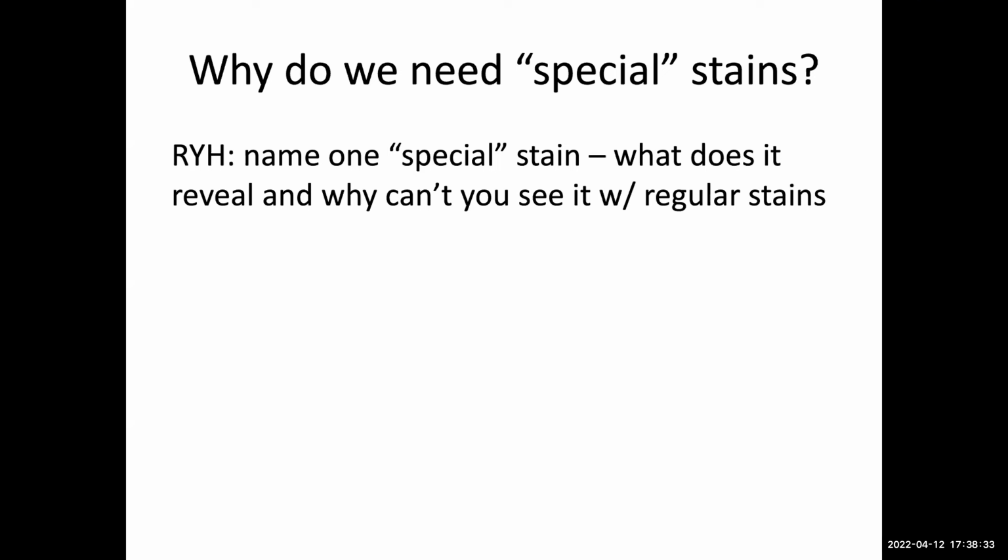But yes, you're absolutely right. It's a combination of dye and mordant alternately applied. So dye, then mordant, dye, then mordant. What mordants do is thicken stain. So it's kind of like a mascara, right? It just thickens the flagella.